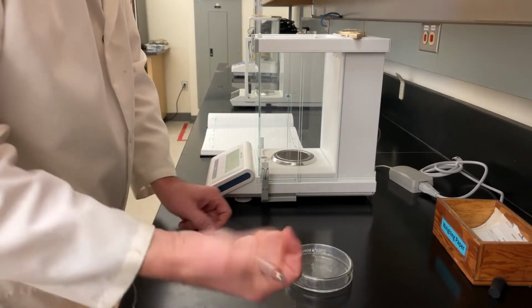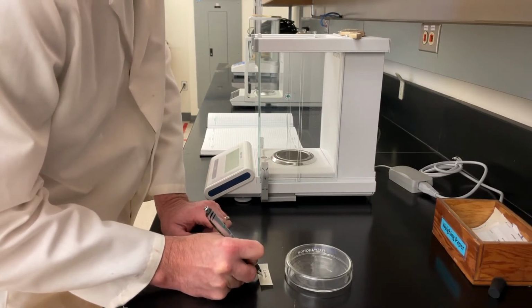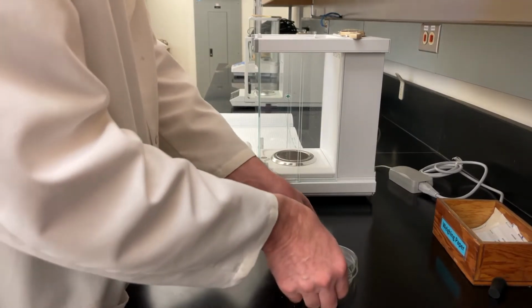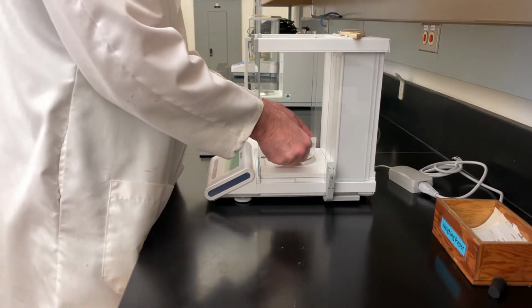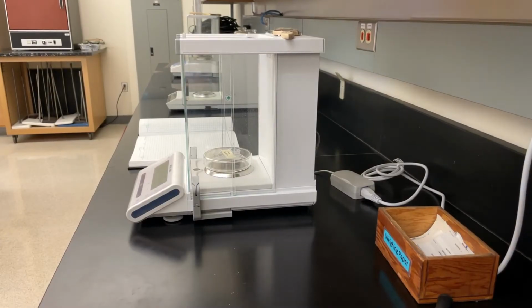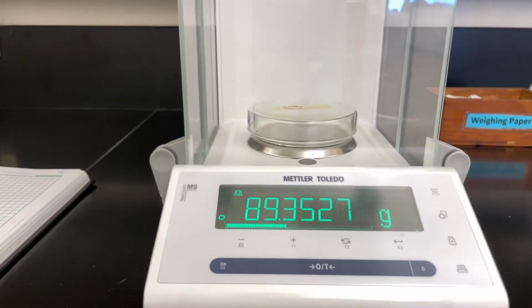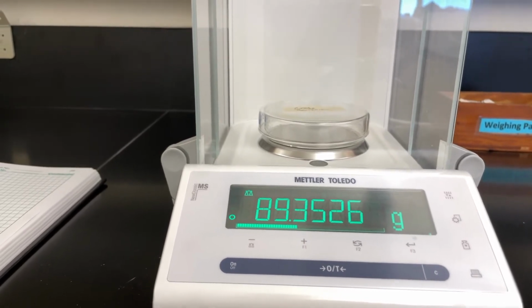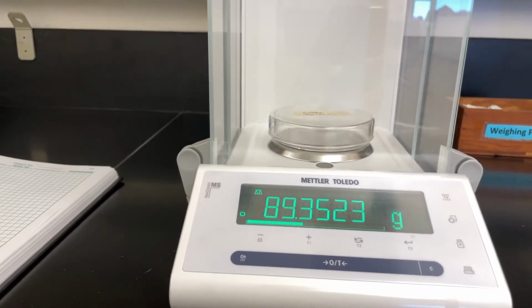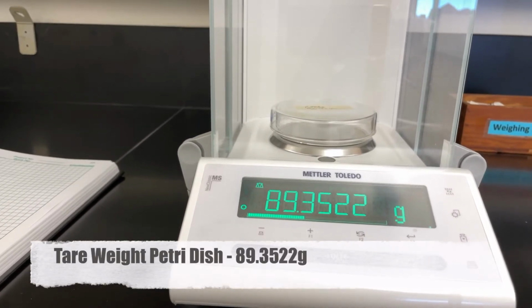Okay, we've got our petri dish. Get a label on this. This is going to be our crude benzoin. All right, 89.35. 2.5, let's call it. Oh, moved on. It's 2.4, 2.3, 2.2, 2.2. That's it. Calling it.